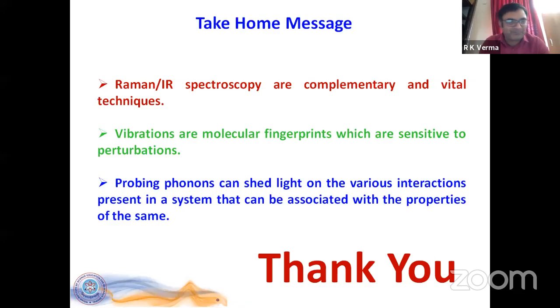Okay. Pinky Rani is asking, what are EG, TG modes and how do we recognize these modes in Raman data? Okay. So in Raman spectrum, every mode is assigned some symmetry notation. Typically A, B, E, T or F are used. When A or B is used, basically that means it is a non-degenerate mode. That means the vibration is unique and it has no degeneracy.